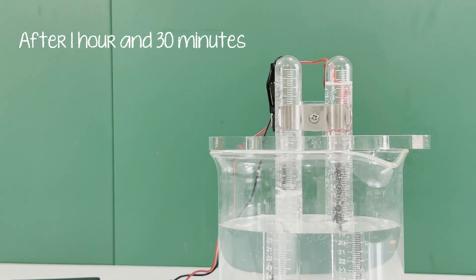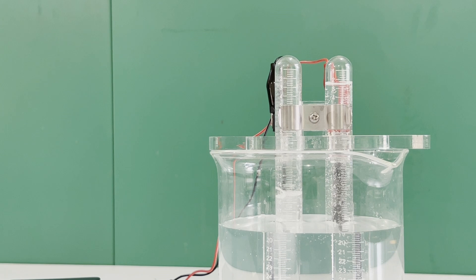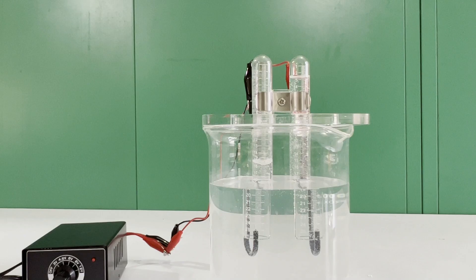1 hour and 30 minutes later, a column of air on the cathode is around 15 ml. Once we have a significant amount of gas, unplug the power source and test the gases.